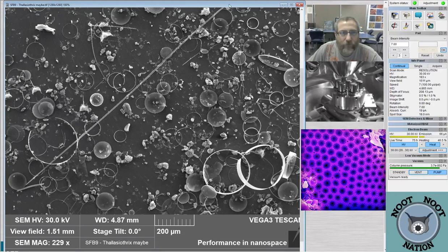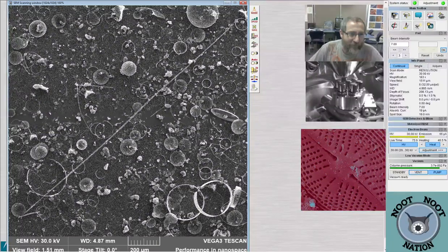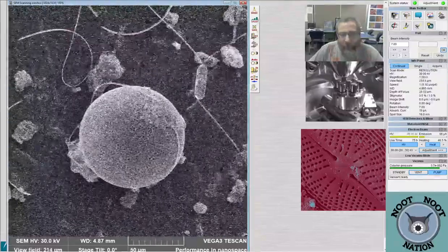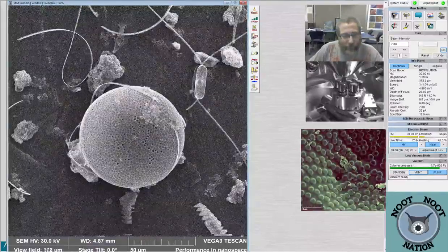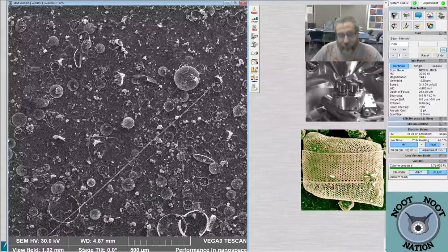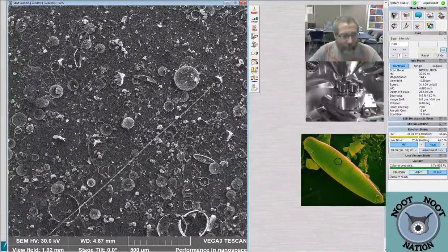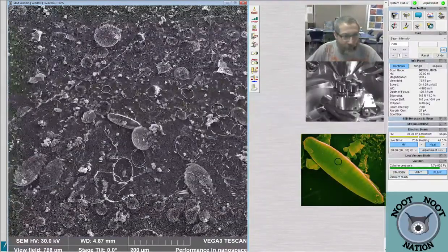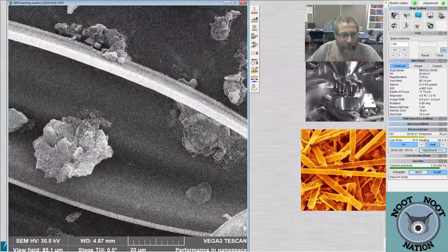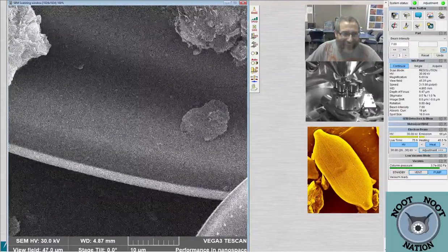Let's see. They say, so if the pores are doing the nutrient uptake, what purpose do those openings at each end serve? Propulsion? Jet engine exhausts? I don't think so. I think there's still quite a bit of conversation about what purpose the rimoportula serves, but one purpose that has been cited is that they think, oh, it's just a Coscinodiscus. They think they're used to help with cell division, so they're sometimes used as anchor points to try to get the nucleus into the center of the valve so that you can start to pull it apart when they go to divide. So that's one explanation that I've heard for what they're used for. And of course, when you're nearly 2 millimeters long, trying to get the nucleus into the center is probably pretty important. I imagine.